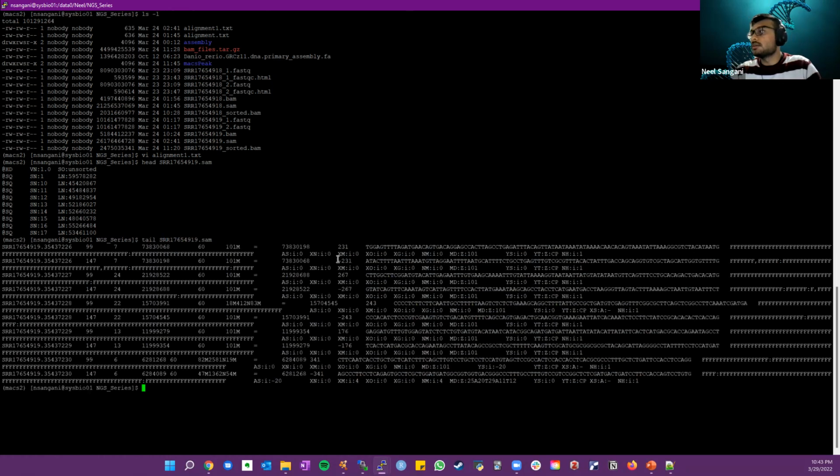Here we're seeing what we talked about: the sequence information, the name values, and where's the sequence information? So yeah, you can look into this file and learn about all the different features.